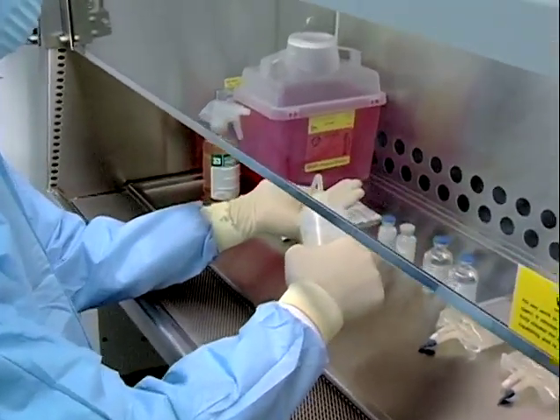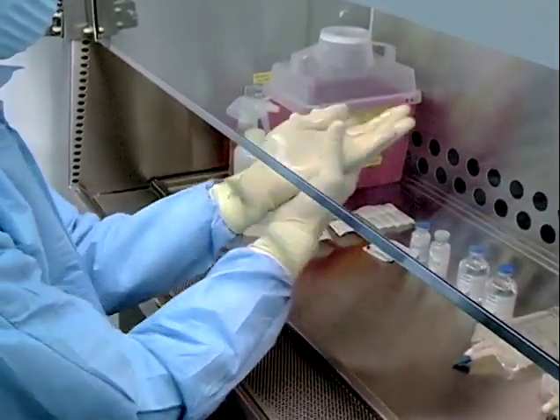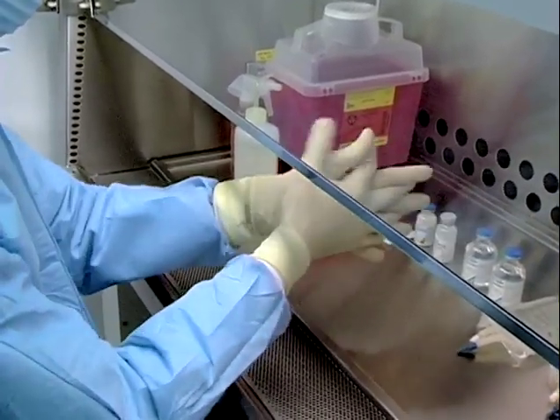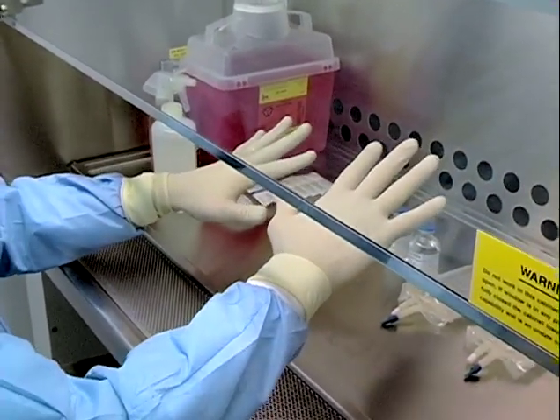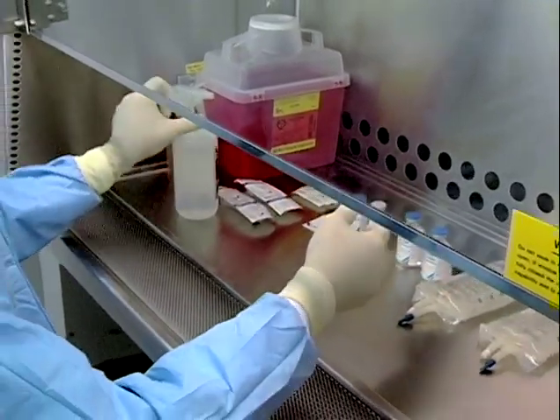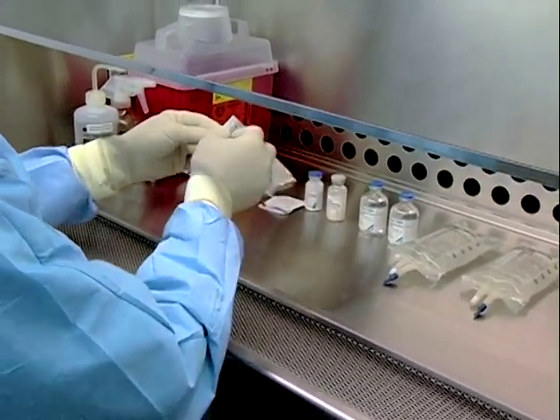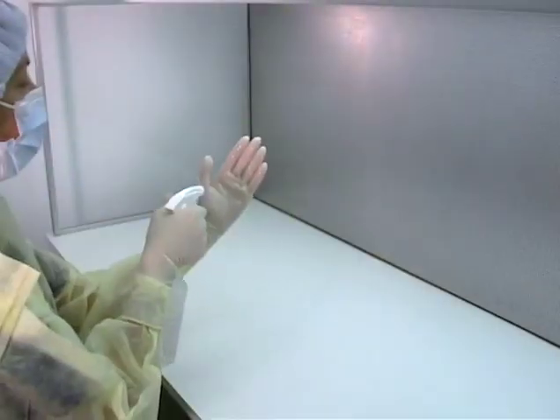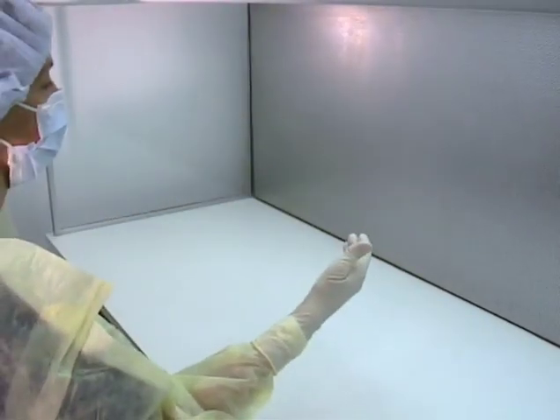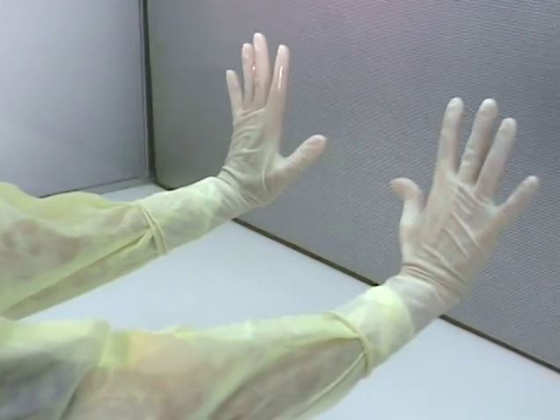This is accomplished by applying sterile alcohol directly to the glove surfaces within the PEC critical work zone while remaining within the first air. Briskly rub the hands together for a few seconds to evenly distribute the disinfectant, allowing it to dry completely. Remember, complete drying of the alcohol is necessary to achieve the maximum germicidal effects of plasmolysis, the major lethal action of alcohol. Also, please note that even such conscientious application of the sterile alcohol will not re-sterilize the glove and work surfaces, but rather will reasonably assure a renewable bacteriostatic barrier over time to minimize the accretion and transfer of microbial contamination to the sterile preparation.